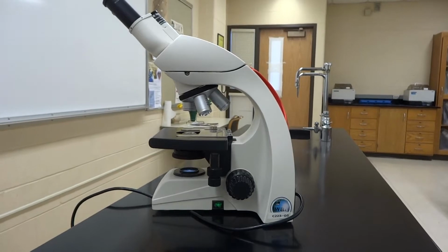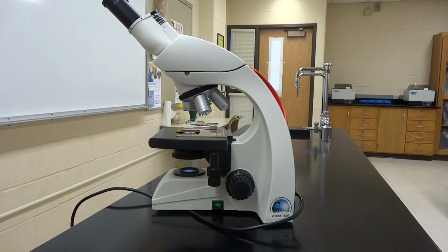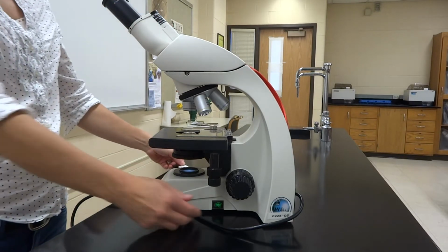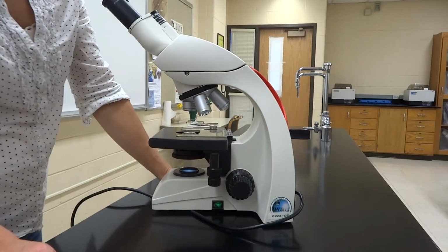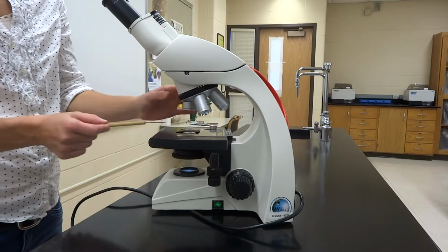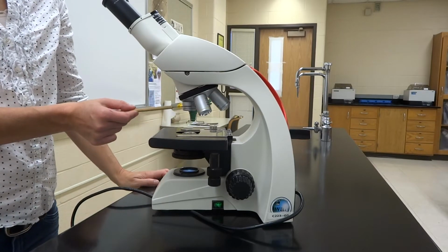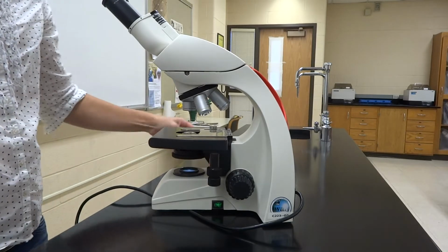Okay, so now what you're going to do is make sure that your stage is all the way down. All right, so the stage has been moved all the way down and your 4x objective is right in place and locked. If it's not locked, you're going to see a weird half moon thing and it looks funny. Okay, so once you've got that, then you're going to get a slide.